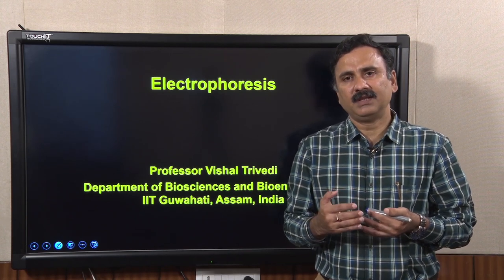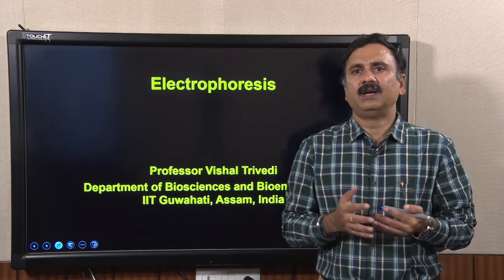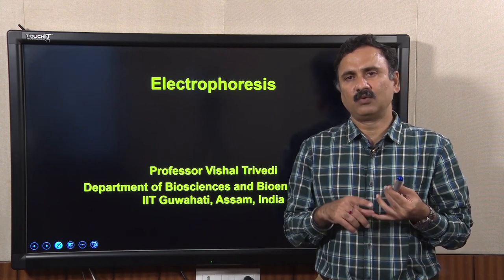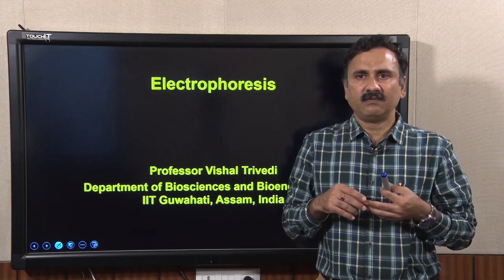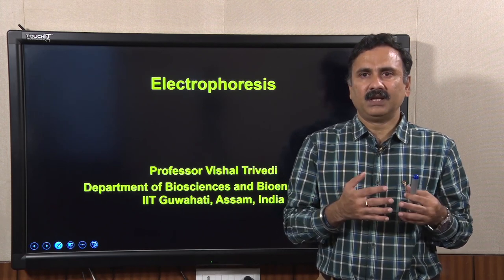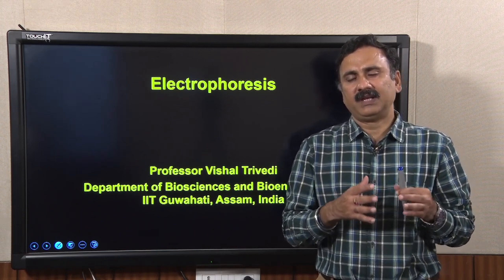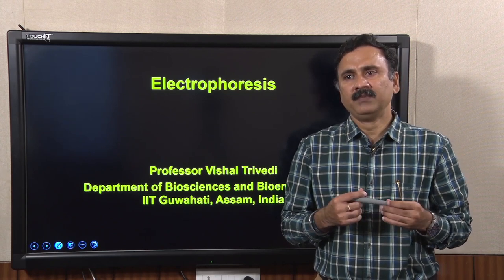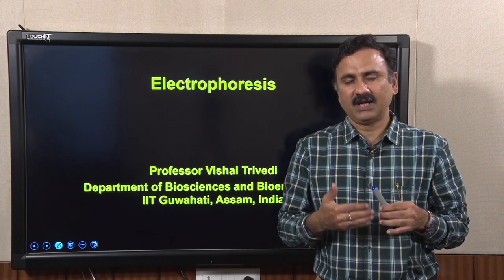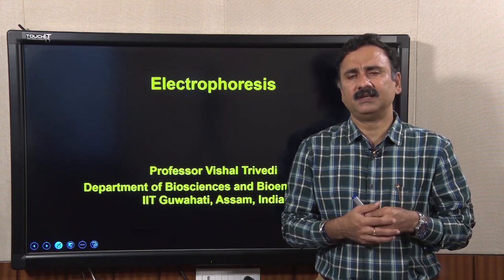Gel electrophoresis is one form of zone electrophoresis, and within that we discussed vertical gel electrophoresis, how to cast the gels, how to run the gels, the mechanisms of stacking of the sample, and other minor details. At the end of the previous lecture, I took you to my lab, and the students showed you how to cast the gels and run the gels.